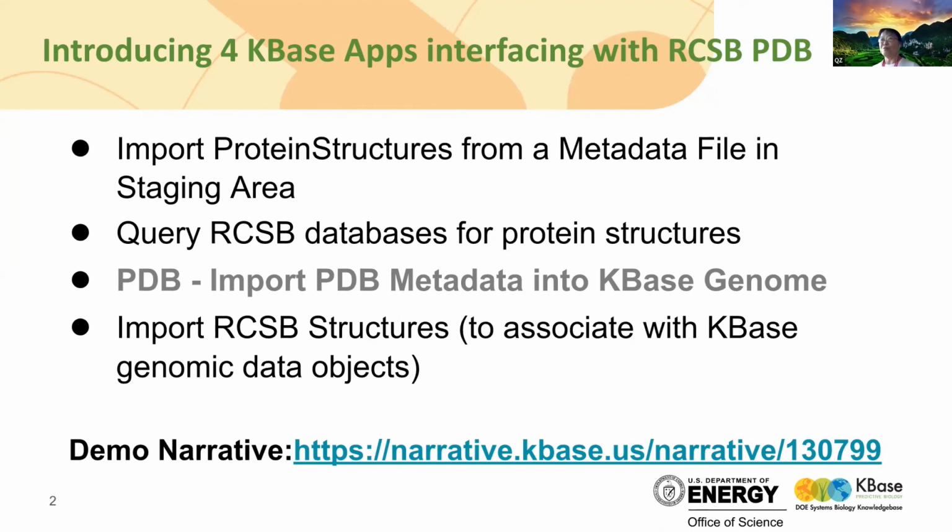Second one, as Dennis mentioned, when you do the simple Google-like search in RCSB, you get the results. If you click on a JSON button, you get to a web interface of the JSON query builder, and you get the result, you run it against the RCSB database. He also mentioned that this app is actually built on that interface, except it's programmatic from inside KBase.